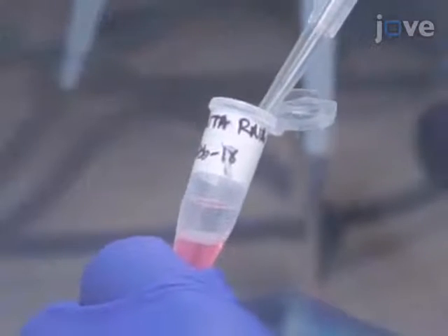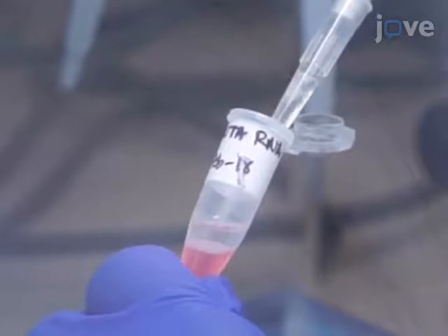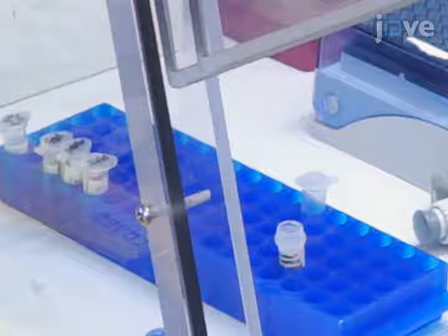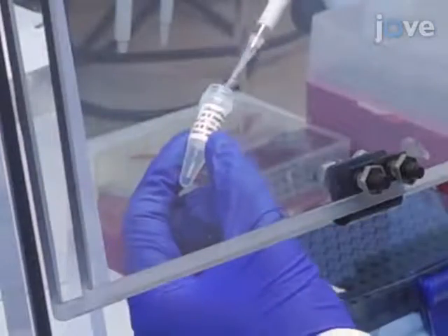Carefully remove the upper colorless aqueous phase and transfer it to a new 1.5 milliliter microcentrifuge tube. Then move on to precipitation and add an equal volume of isopropanol to the sample. Add 1 microliter of co-precipitant to the sample to act as a carrier.